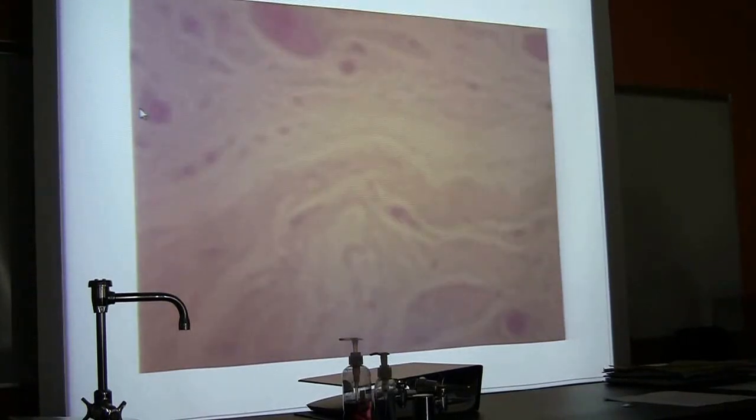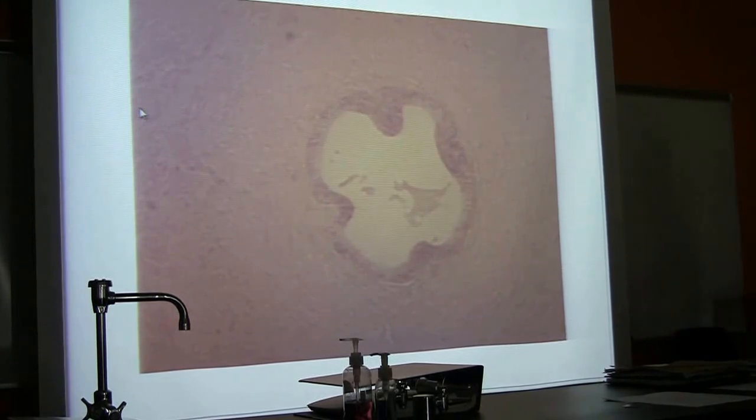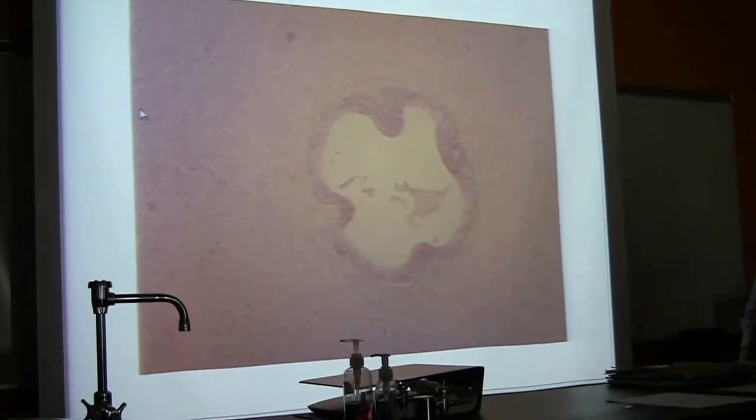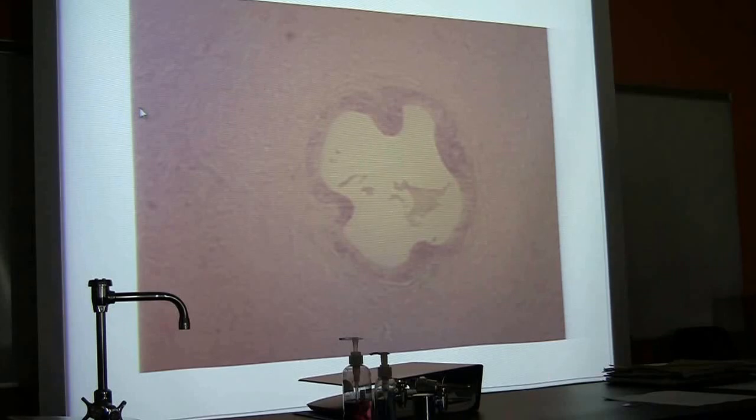Now be careful, because a lot of slides are labeled spermatic cord, and the spermatic cord and the ductus deferens are not one and the same. Think of the spermatic cord like a cable with a lot of tubes or wires within it, one of which is the tube that actually carries the sperm, which we see here, the ductus deferens or vas deferens. Again, it goes from the scrotum, where it connects to the epididymis, up in the body cavity, where it connects to the prostatic urethra running through the prostate gland, just inferior to the urinary bladder.